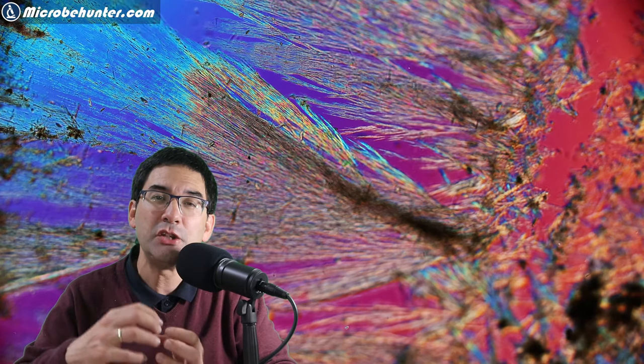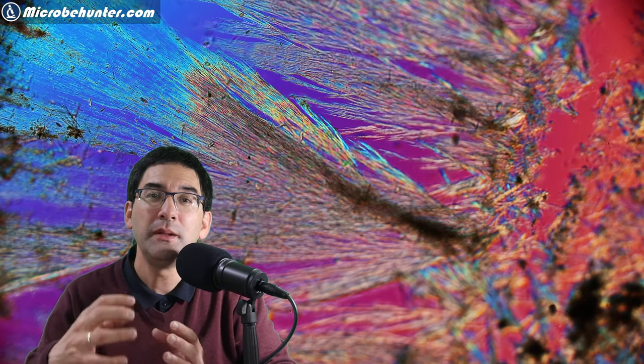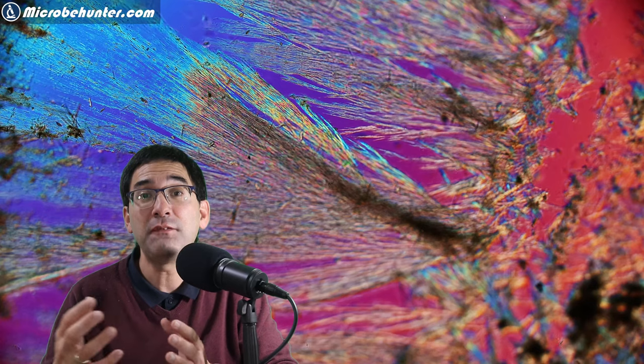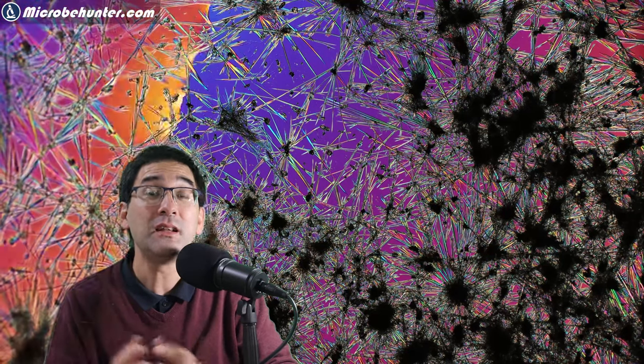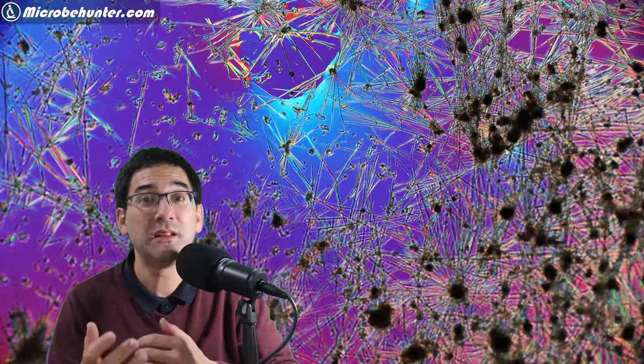Because the molecules are arranged in a very regular way in the crystal and because the caffeine molecule is not symmetrical, the crystal is optically active and changes the polarization of light. When you have a polarizing microscope with a polarizer and analyzer filter, you're able to see the crystals in a very colorful way.